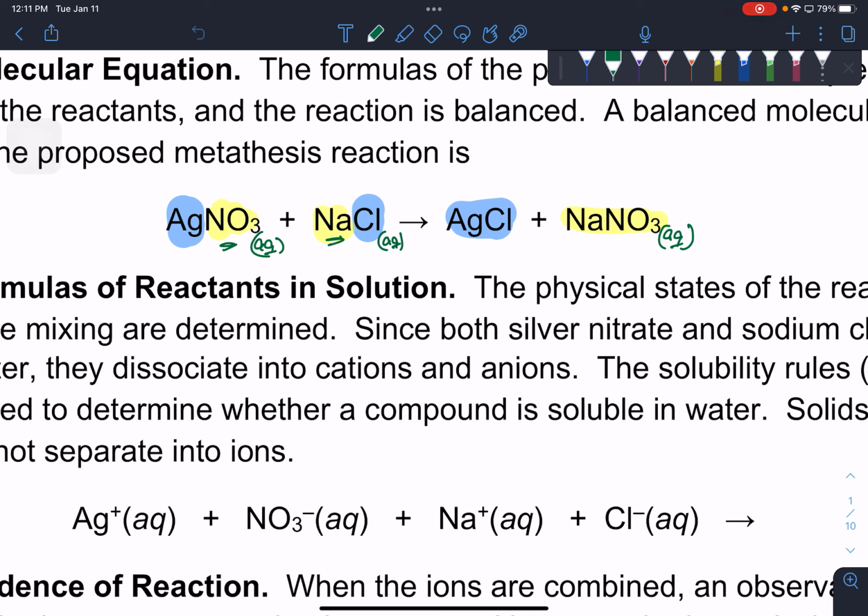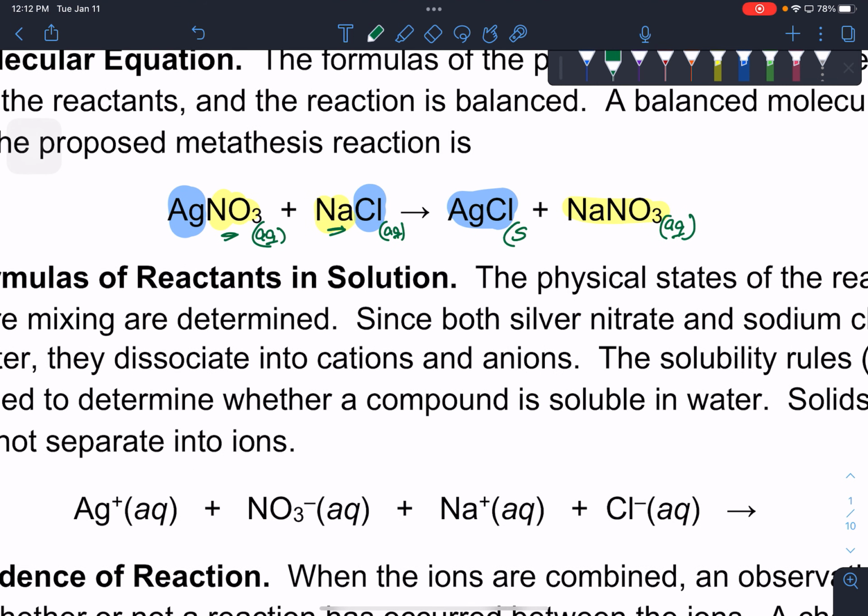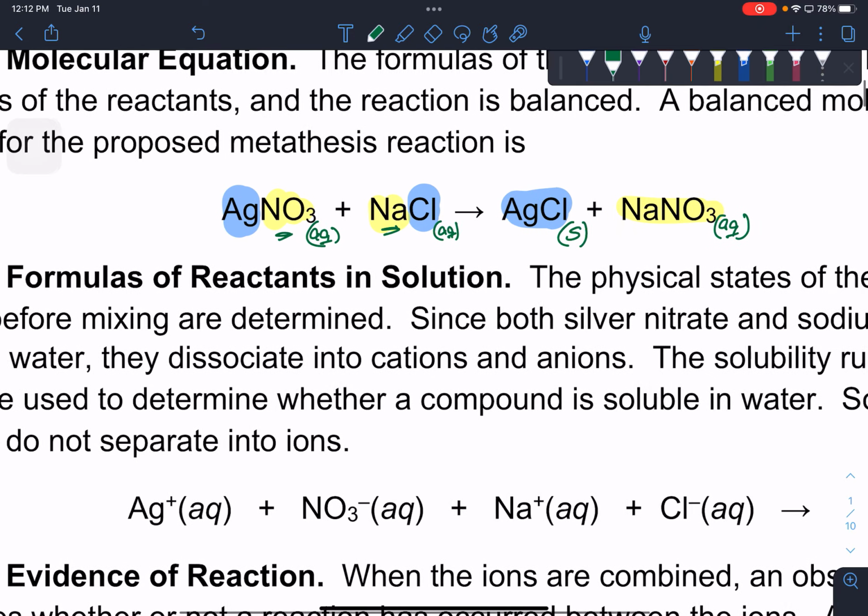And then, well, we just talked about, if you look at the periodic table over there, iodine. Well, iodine, bromine, and chlorine, and fluorine to some extent, they're cousins of each other. They're all halogens, and they all form very similar insoluble salts. And one of those is this insoluble salt with silver. And you can look back at that solubility table.